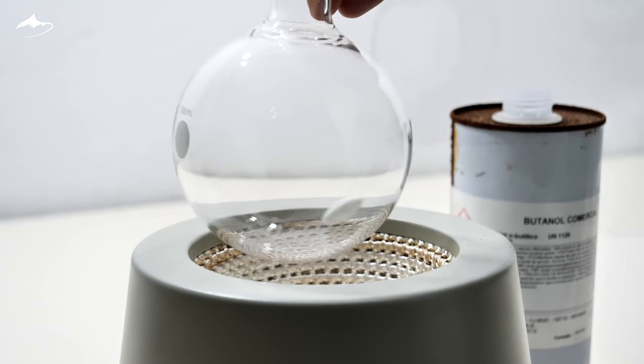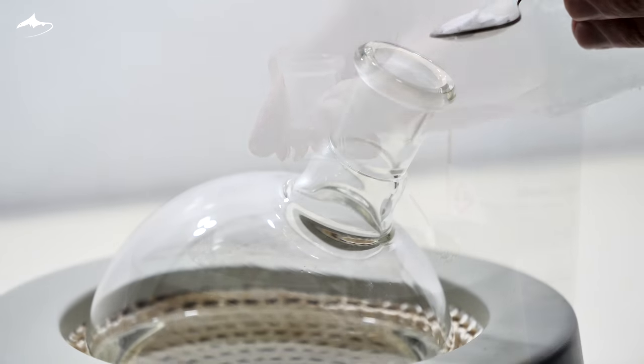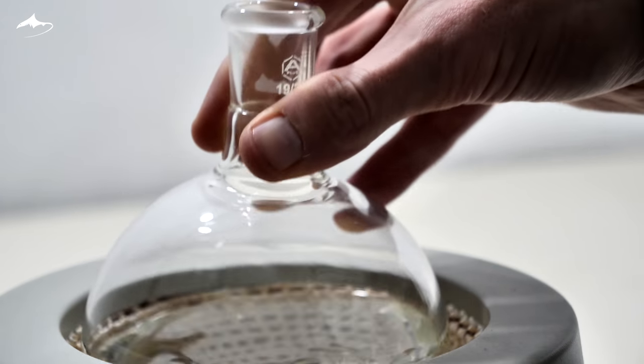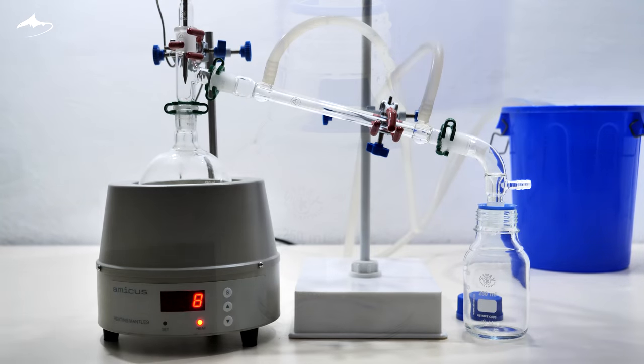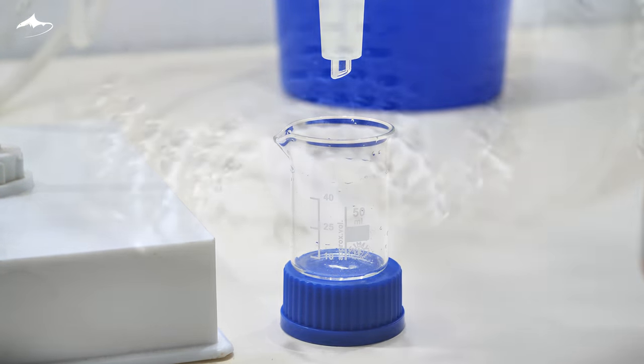First of all, let's get some fresh butanol, as this bottle I have is very old. A few scales of potassium hydroxide are added to remove any organic acids present. Then, a small beaker is placed in order to collect and discard the first fraction of distillate.